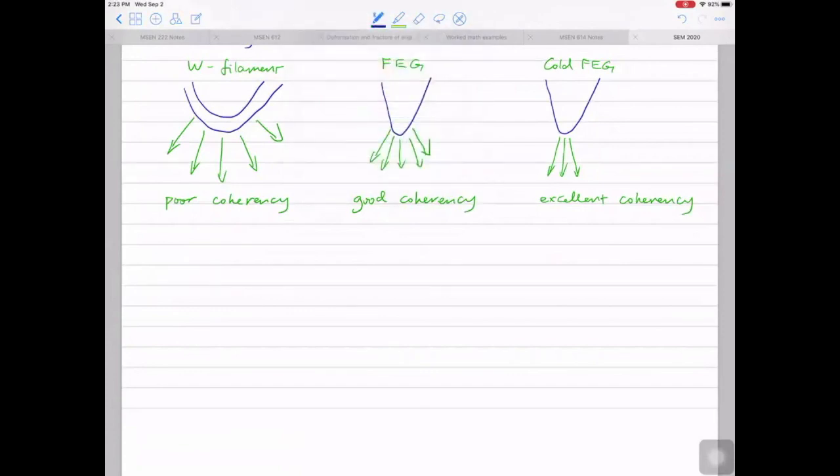Okay, let's look at the very last topic relevant to what we learned today. Remember last week we had a very quick look at resolution. Today I want to take one step further to give you a bit more information. So let's just call it a closer look at resolution.